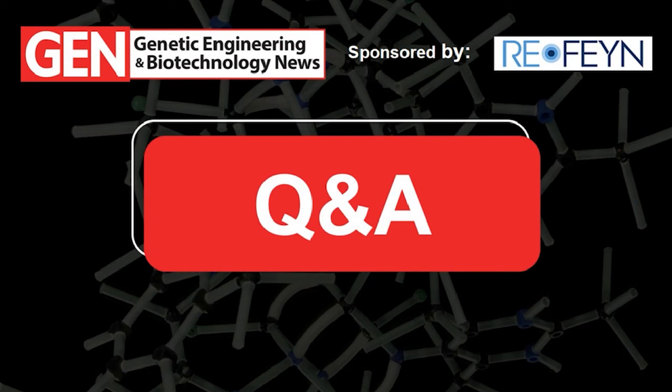Okay, and next question we have, this is a pretty good one. Can the SamuxMP be used for the analysis of other viruses, such as, say, lentivirus or retrovirus? Unfortunately not. The reason is that these are significantly bigger, about 4 times bigger than AAV. And above 80 nanometers in diameter, we are entering a different scattering range. And as we are measuring scattering, we cannot scale the system to that size. So we can only measure AAVs or things of similar diameter, around 25 nanometers or 3.7 megadalton.